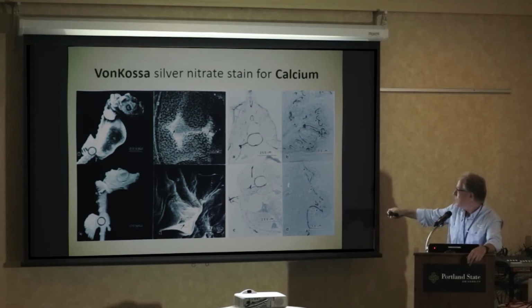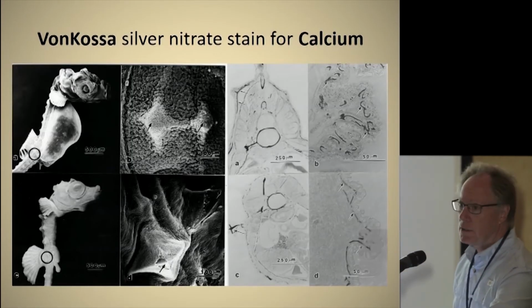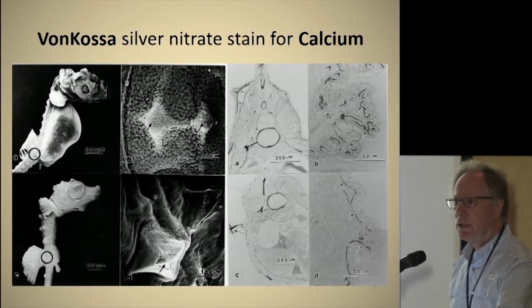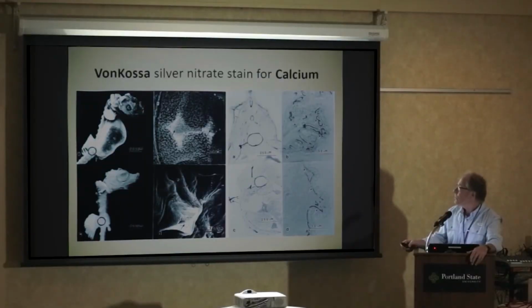And this is, again, later stage, when most of that calcium has disappeared from the brood pouch of the male, but it shows up in deeper calcification, this actually being one of these scutes inside. So there again, a different histological stain, von Kossa silver nitrate, where you basically, just like developing film, get black deposits only where there is calcium, and everything else turns out bleached white.